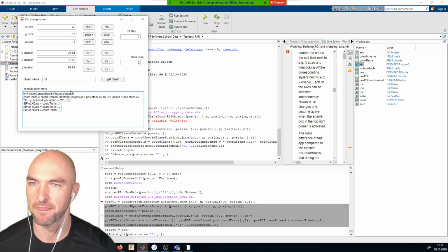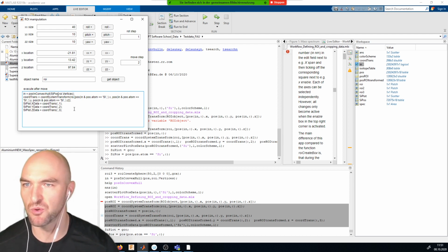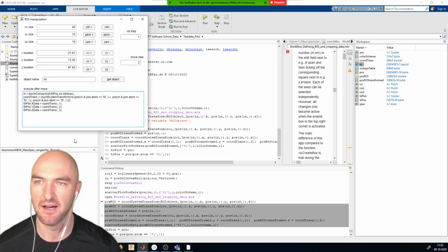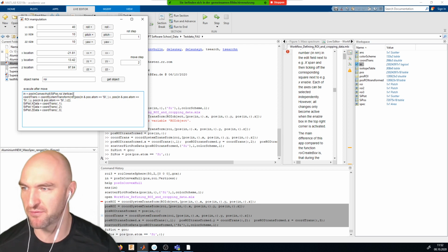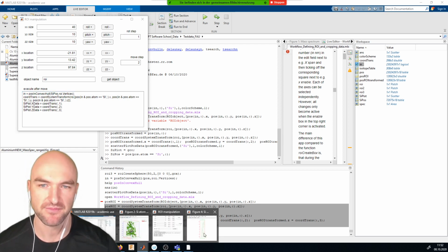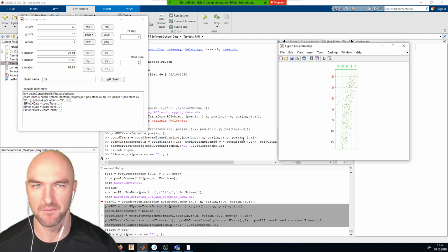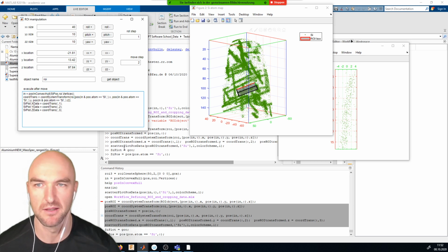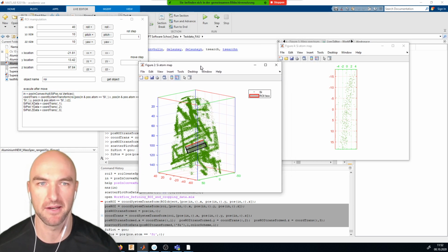Silicon pos, then do a coordinate system transform. In this case, obviously, we can get rid of the indexing here because all of the atoms are silicon atoms by definition. It probably doesn't make much difference in terms of performance, so I'll just leave it in for now. And if I go now and move things, it will be a whole lot snappier than it was before.